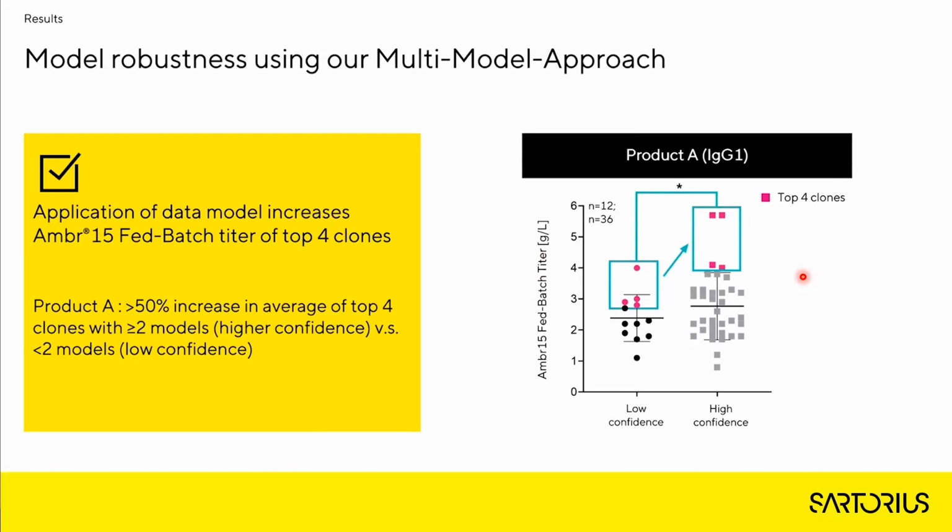So we also did another study and analysis to check the model robustness when we use our multi-model approach. The idea here was that we used the data for one product. And for that specific product, the selected clones had different scores, for example 2, 3, 1.